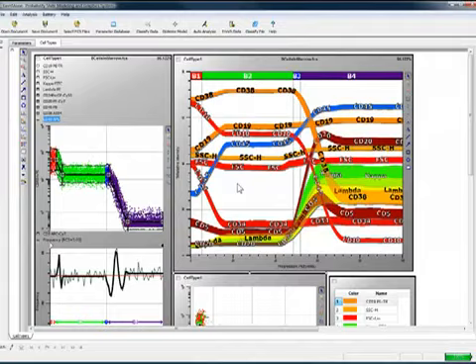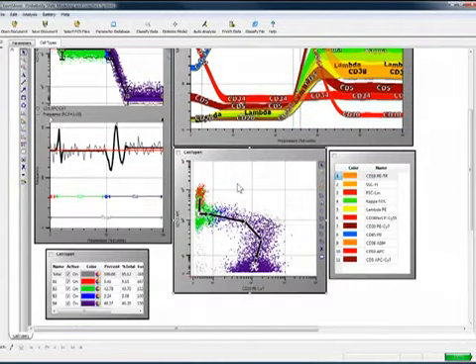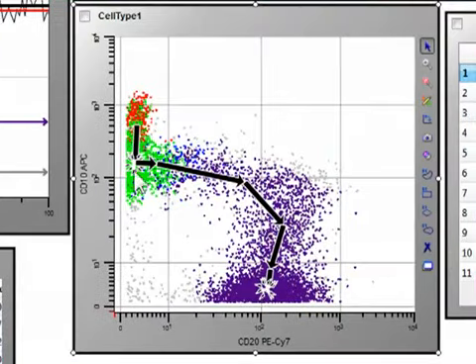The other thing I wanted to show you is that if we look at a typical bivariate here of 10 versus 20, you can see that each of these stages is being represented with the colors of the dots. But you also can see arrows indicating the progression of the model through the data.